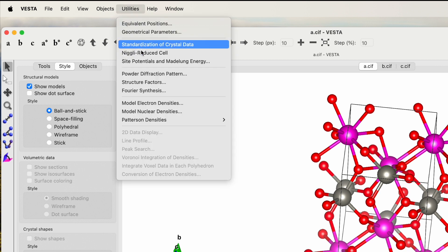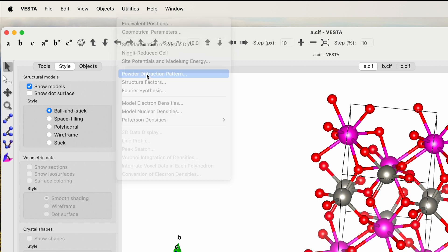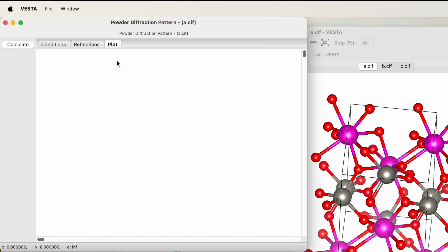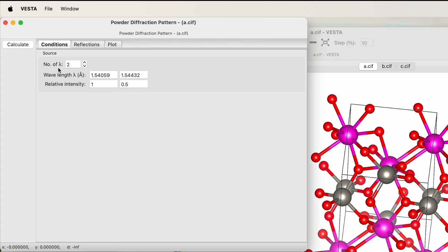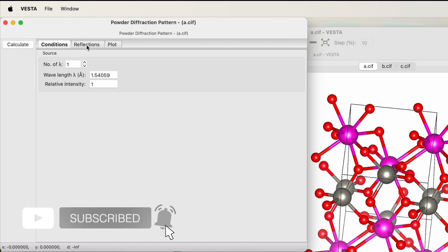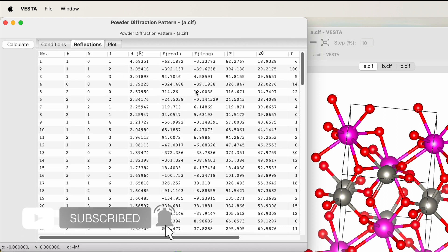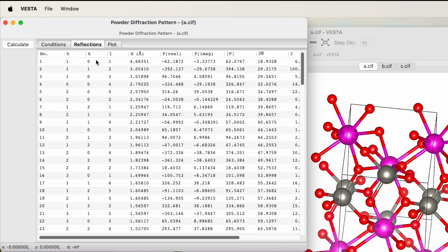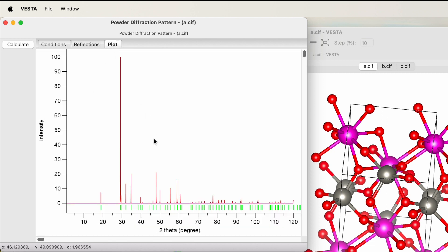Now what you need to do is go to Utility, click on the Powder Diffraction Pattern. In this case you need to give the condition: number of wavelengths is one, and the wavelength lambda is 1.54. This is copper K-alpha. If you are using a different wavelength then you just type those numbers over here and hit the Calculate button. It will generate the reflection list. Here you can find the values for 2-theta with respect to plane, and in the plot you can see the XRD diffractogram created by using this CIF file.